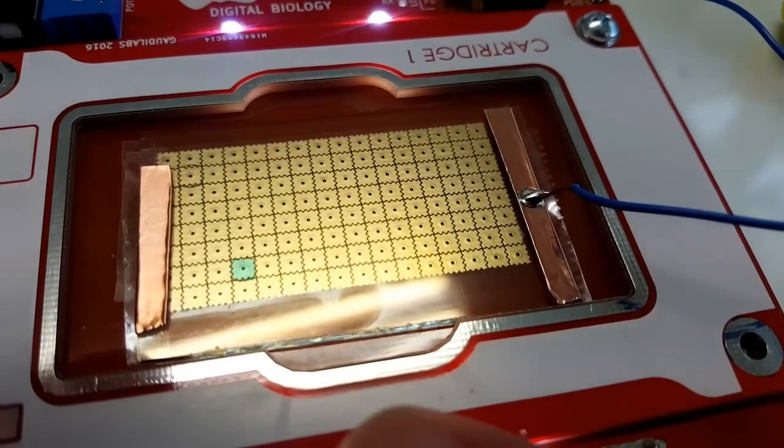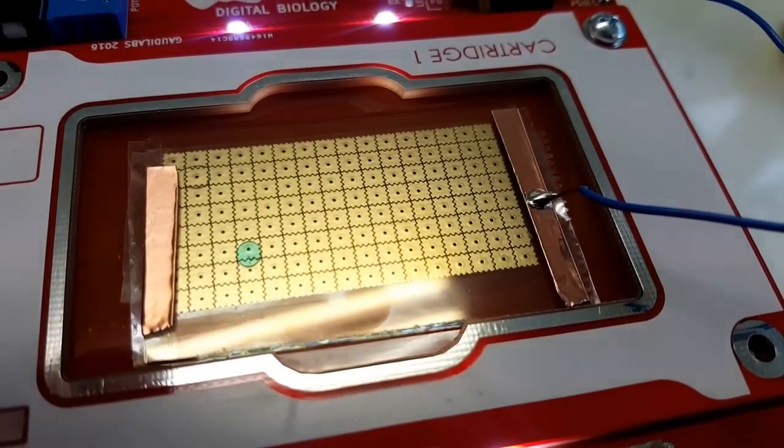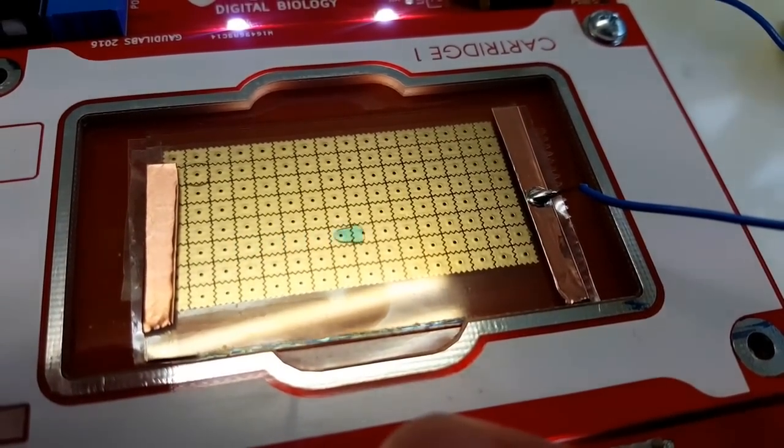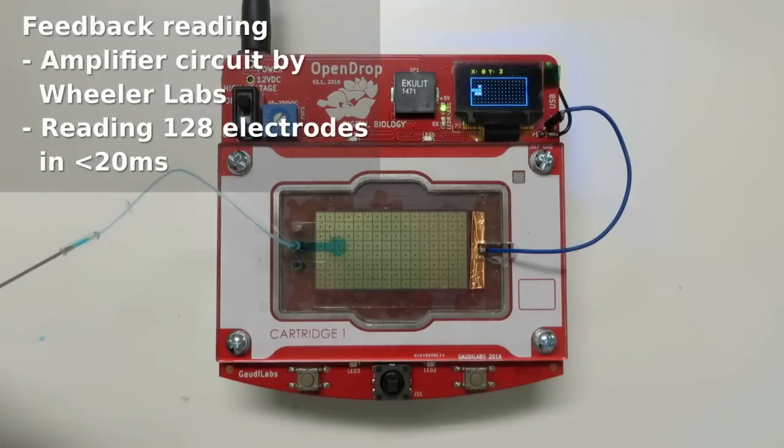It can happen if an electrode is not functioning well, like now, that the droplet gets stuck. That's why we need the feedback drive that I will demonstrate in this video.